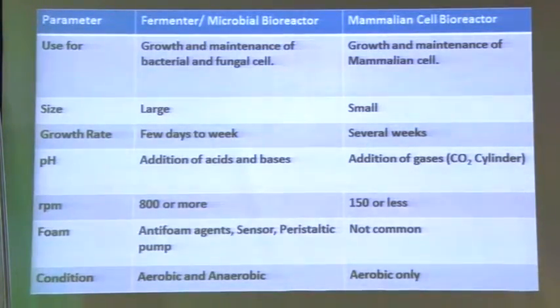In the case of your bioreactor, you attach a CO2 cylinder. The maintenance of pH is performed by the CO2 cylinder, and this particular CO2 cylinder is going to maintain a particular kind of buffering system. What kind of buffering system? Carbonate, bicarbonate buffer system, right? As a result, the pH is maintained inside the bioreactor where you have added your animal cell or your mammalian cell.